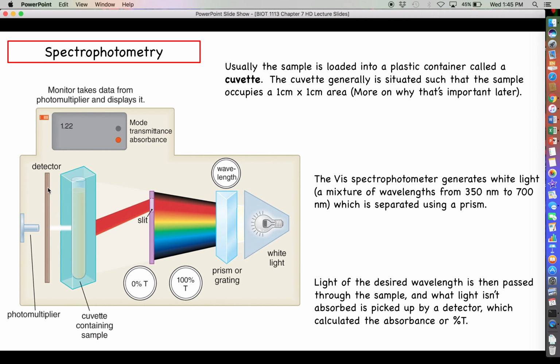If we get the absorbance of a particular solution, and if we know the path length, which we do because it's always 1 centimeter, and if we know the molar extinction coefficient, which we should because we can look that up, the only one of those 4 variables that we should not know is the concentration, and we can use very simple algebra to solve for the molar concentration in terms of moles per liter. This is really nice. Really, really nice.